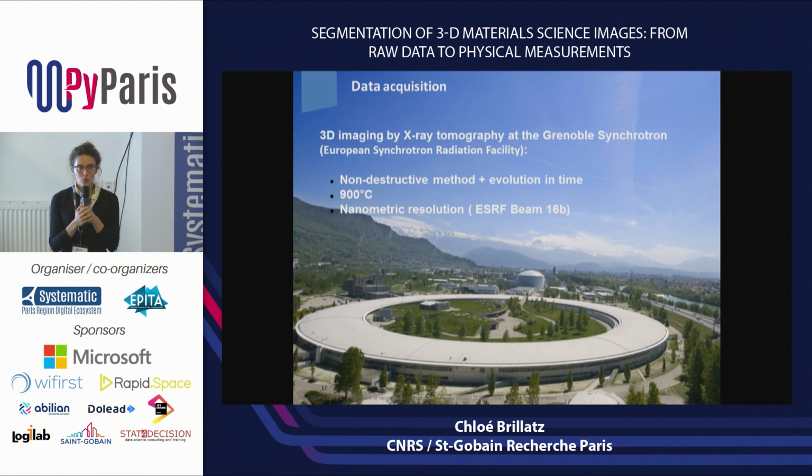It's a non-destructive method, so that means you can see inside your sample without having to destroy it, which is quite cool. And plus you have access to the fourth dimension, because in our case, we were taking 3D pictures of our sample every 3 minutes, so we have the evolution of our sample through time.